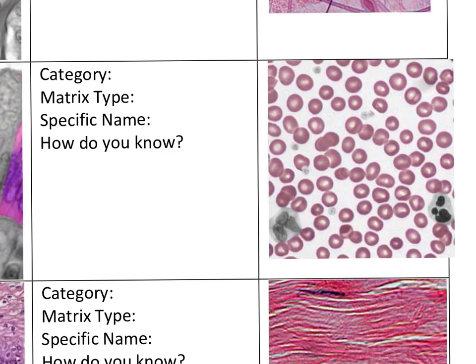This one's tricky to look at. What you see between each of the cells is nothing, and what would actually be there if this were a living sample would be a fluid. This is something with a fluid matrix, and the only thing we've really talked about as having a fluid matrix would be blood. Because it's a fluid matrix, you expect the matrix in here to just be kind of clear, especially under a microscope. In actual blood, if you separate the cells from the plasma, the plasma itself has a hint of a yellow tint to it.